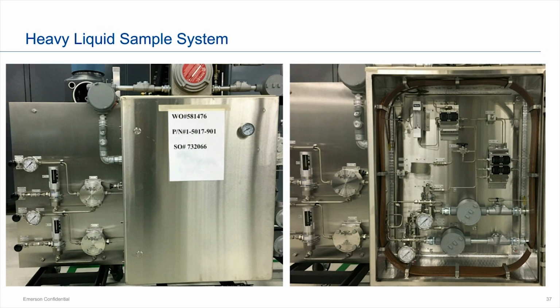Again, you do not want to have a significant time go into your vaporizer. When you vaporize a liquid, you can literally go up to 600 times the initial volume. So you need to be very careful about overloading the vaporizer. You want to make sure you don't do that, again, because you can cause fractionation, or you can cause basically a two-phase situation where only half the liquid will vaporize, the other half will stay as a liquid and go onto the GC that way.